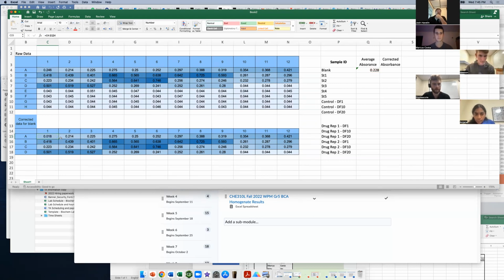So equals. How do you do that again? Just put your dollar signs in front of your column ID, and then a dollar sign in front of the row ID. So this locks the column and the row. You can do it in other ways where you only lock the column or only lock the row. If you put it for both, like this cell ID that I just pointed to, this cell ID won't change. Got it? Yeah, okay, thank you.